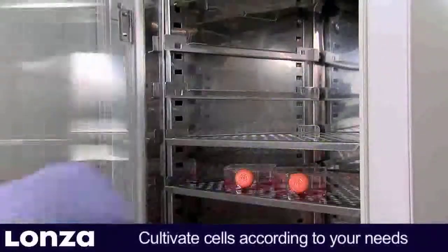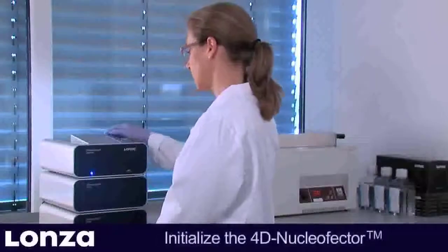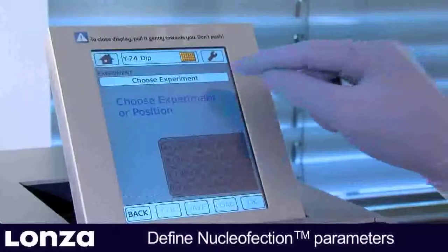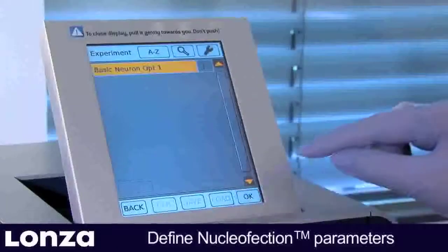Nucleaffection can be performed at any time during the culturing period. On the day of transfection, initialize the 4D Nucleaffector system and define or select a nucleaffection experiment. For the initial optimization experiment, choose the template parameter file predefined by LANZA.